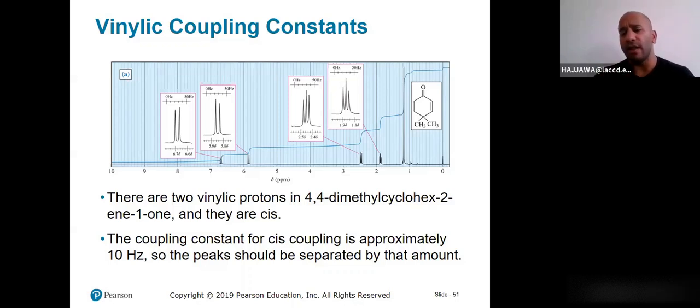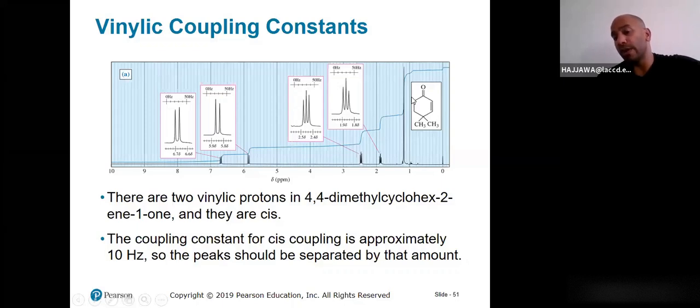Okay. The final thing to extract out of this proton NMR spectrum is the signal splitting, so the shape of the peak. Why is this a singlet? Because these two methyl groups have 0 adjacent hydrogens. 0 + 1, that's 1. That's why it's a singlet. Okay. Next would be the CH2 right here. It has 2 hydrogens attached on the adjacent carbon. So 2 + 1, that's 3. That's why you see it's a triplet. Same applies to the other carbon, the one underneath. It's going to have 2 adjacent hydrogens, so +1, which is the N+1 rule. That's why it's a triplet as well.